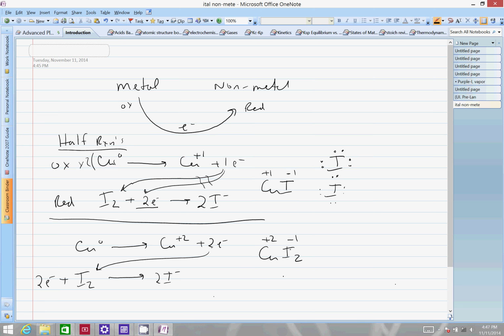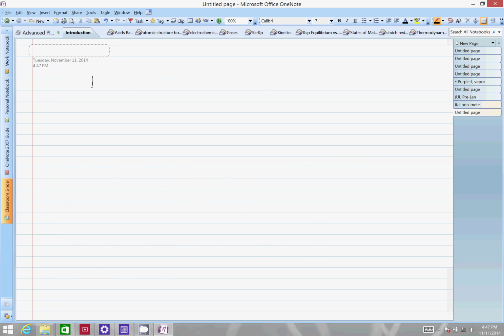So in this case, in our laboratory, we're going to basically look and see from investigation what's our ratio of copper and iodine in the end. We're going to do this through a couple simple weighings. All right, so a little bit about the actual lab, a little bit about this procedure.